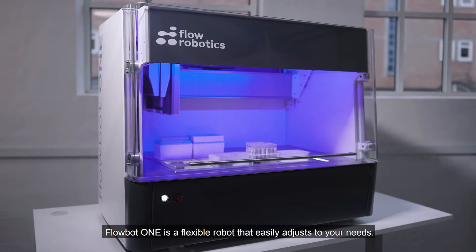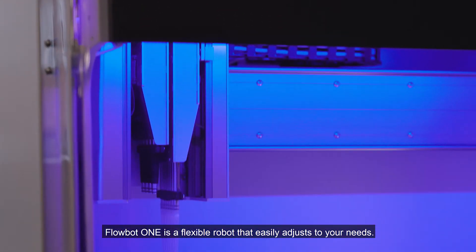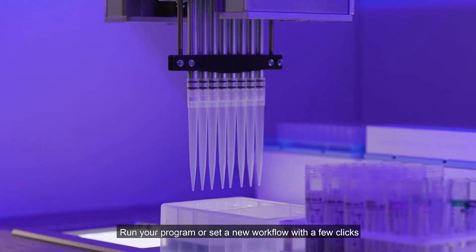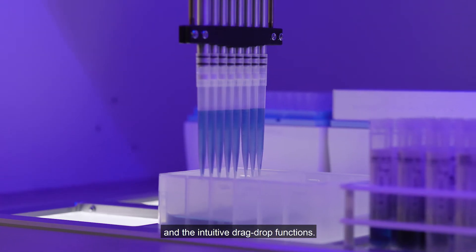FlowBot 1 is a flexible robot that easily adjusts to your needs. Run your program or set a new workflow with a few clicks and the intuitive drag-drop functions.